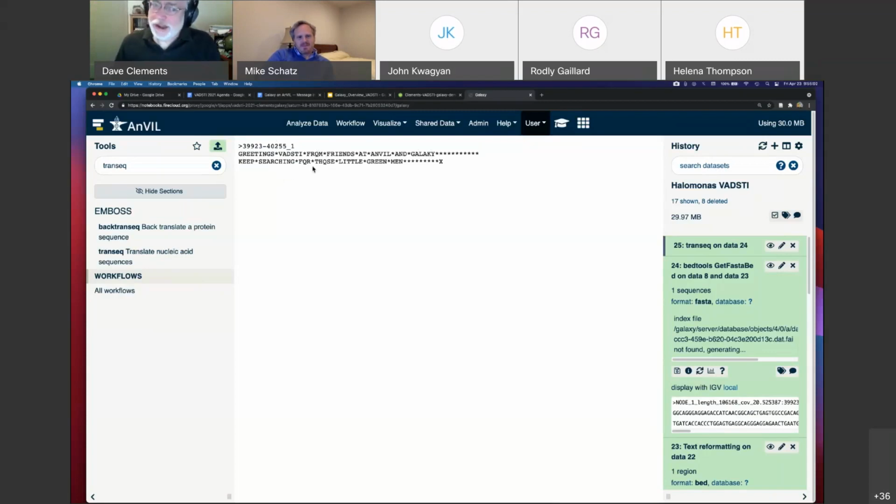So we now have our result. We started with this sequence from this experiment we ran, and we wanted to know what's the difference. And we walked through it. We ran, I think, 7 tools to do that. We had 5 inputs, and we got to this point, okay?